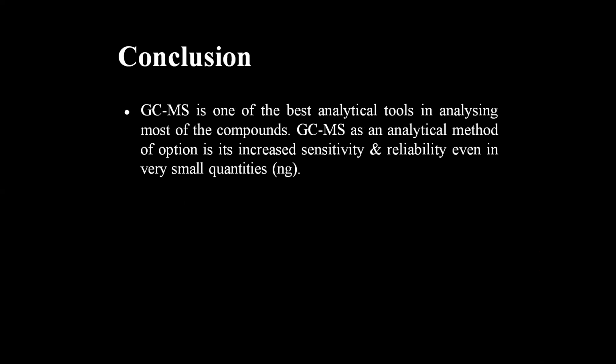In conclusion, GCMS is one of the best analytical tools for analyzing most compounds. GCMS as an analytical method of choice has increased sensitivity and reliability even in very small quantities.